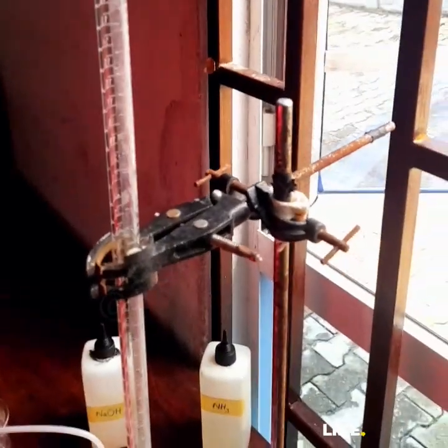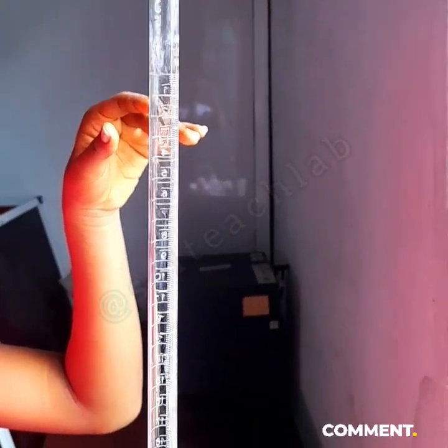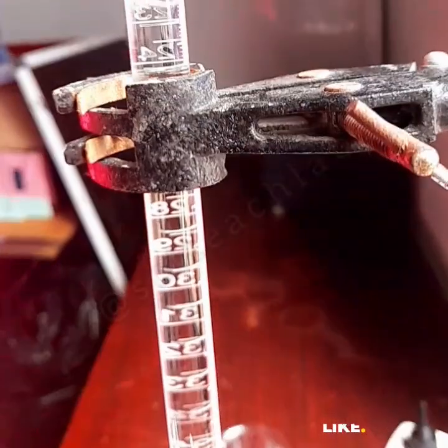So the next thing is to fill in the burette. That's put A, which is D in the equation, so let's call it D. I'm putting D into the burette right now. My burette is a standard burette, so it's measured from 50 to 0 from top and 50 down there. So I'll fill it up. You can see I'm filling the D, which is HCl, into the burette.